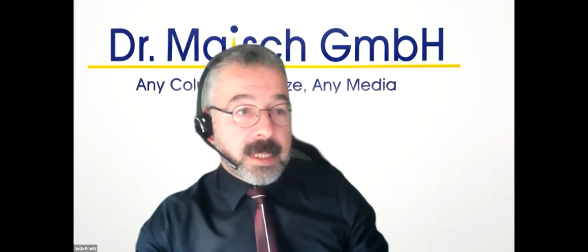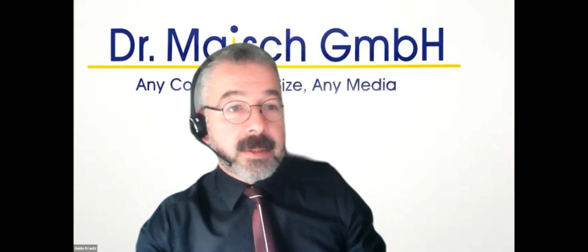Okay, someone wants to speak up again? Yes, please. Go ahead. Thank you again. Noam Freeman from Israel. I was wondering whether there are examples of chiral separation on the laboratory flash devices that carry a 20 micron particle size as opposed to the standard HPLC 5 micron particle size.